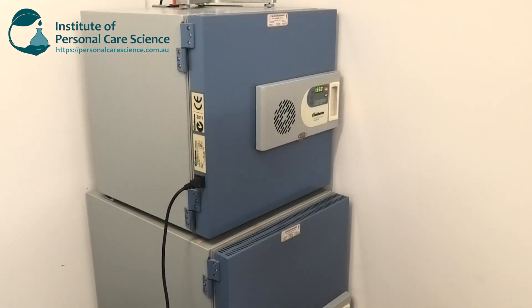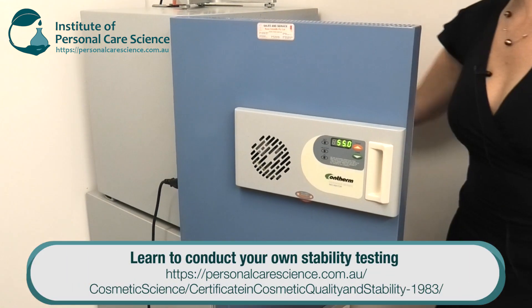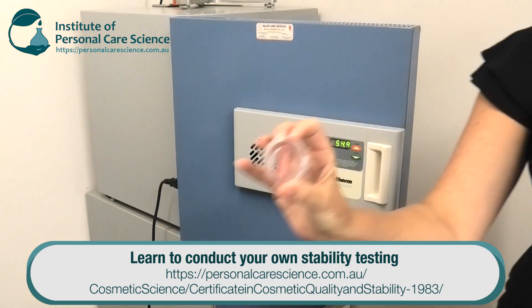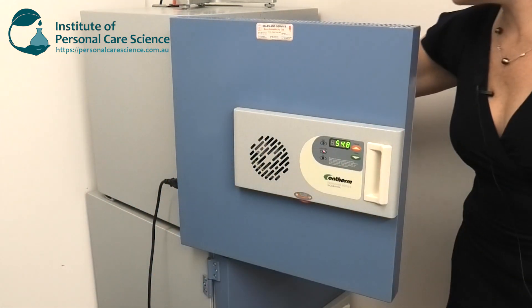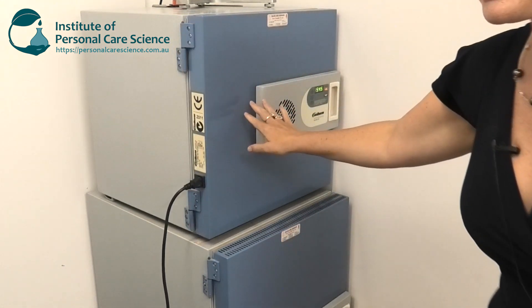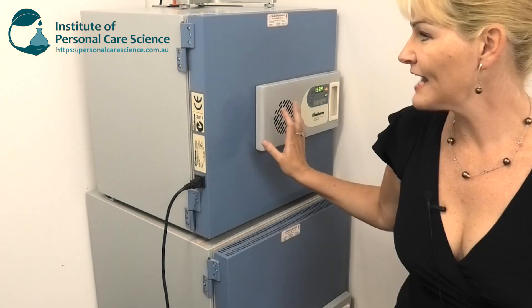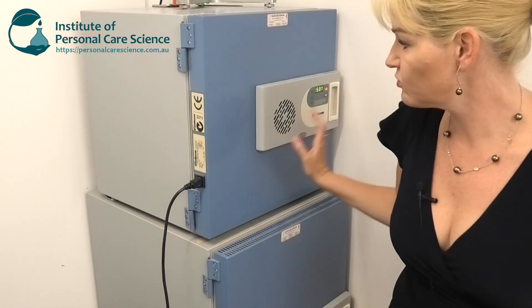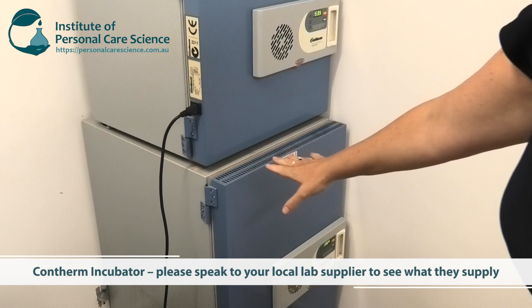We test for hardness and melting of any lipsticks or lip balms, so 55 degrees is a really good test point for short-term, very high temperature accelerated stability testing. It's also great to test if lipsticks are going to melt in hot cars, because we set it at 55 degrees.